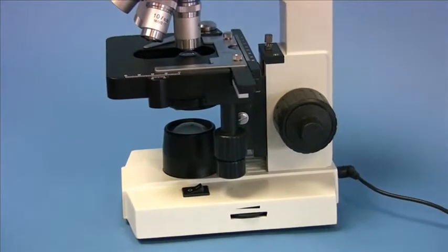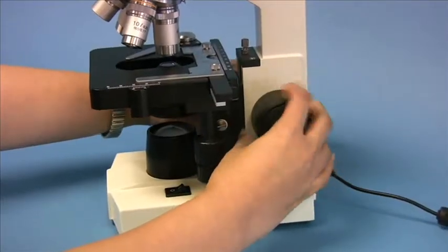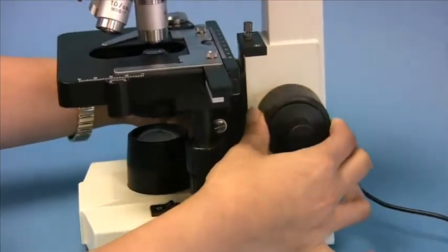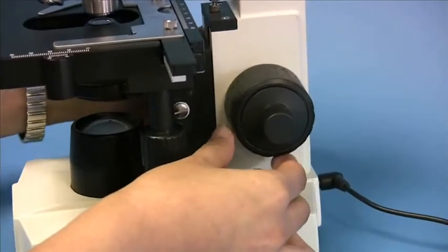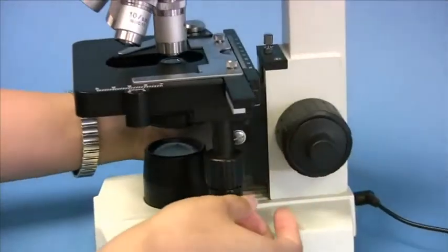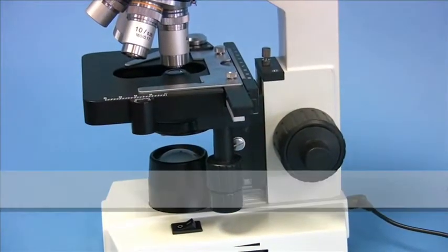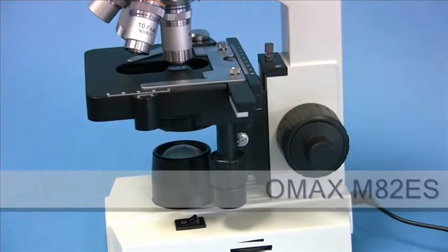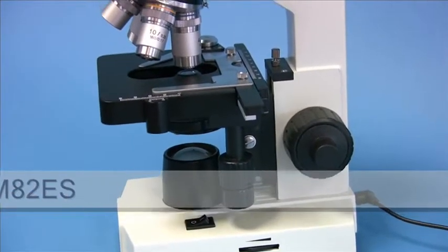Also, this model has coaxial, coarse, and fine focus adjustment knobs on both sides of the microscope. This feature is designed specifically to ease the adjustment required for your observation.